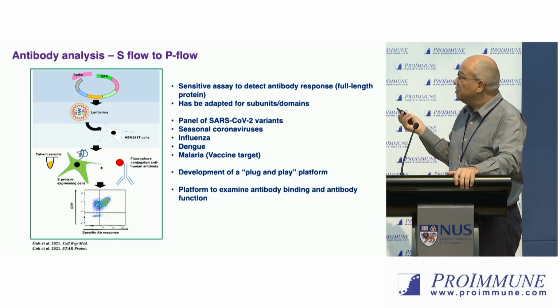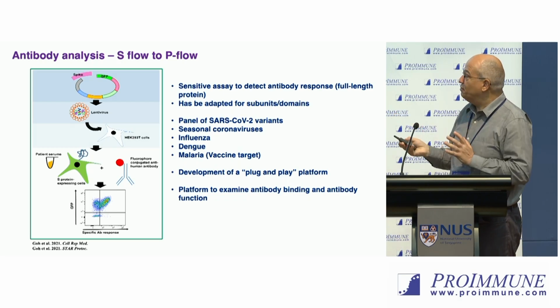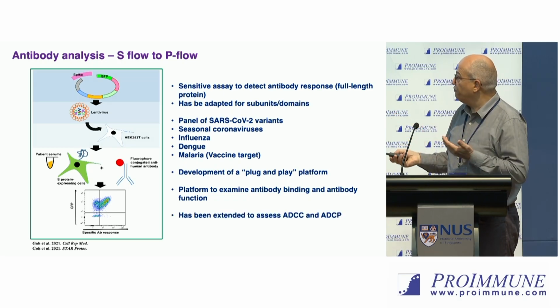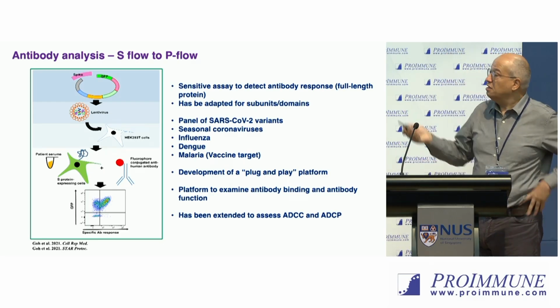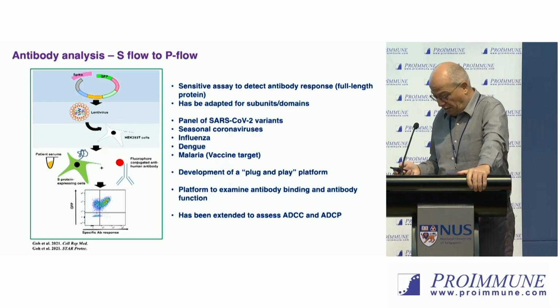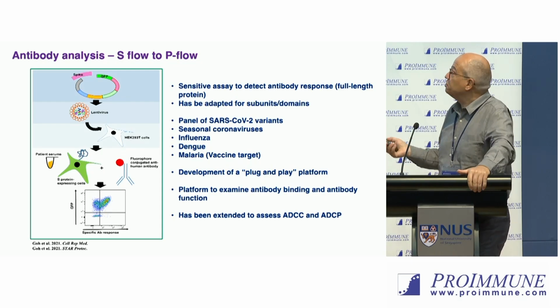And we could now also use it for antibody binding, but this could also be used for other functions, and it has been extended to ADCC and ADCP with a specific cell. So it's a very versatile system, and I'm happy to collaborate with anyone who is interested.